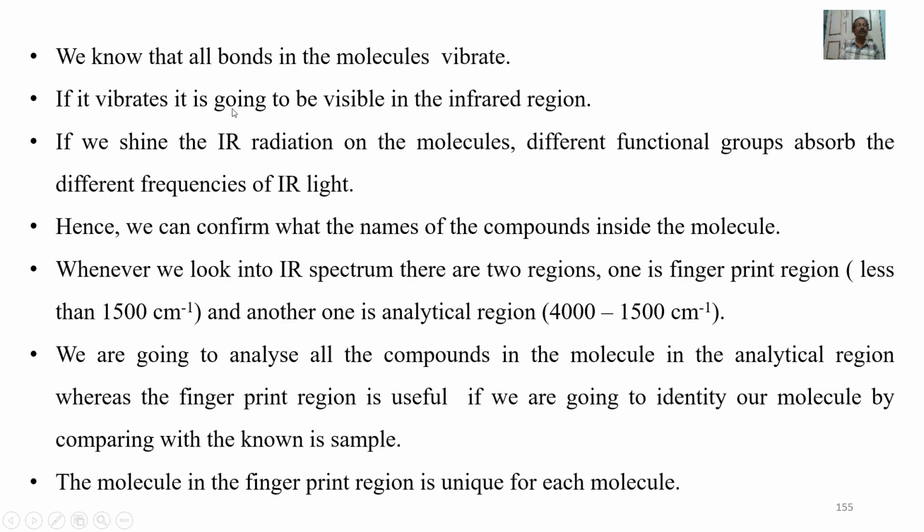We know that all bonds in the molecules vibrate. If it vibrates, it is going to be visible in the infrared region. If we shine IR radiation on the molecules, different functional groups absorb different frequencies of IR light. Hence, one can confirm the functional groups inside the molecule. Whenever we look into an IR spectrum, there are two regions. One is the fingerprint region, which is less than 1500 cm⁻¹, and another one is the analytical region, which lies between 4000 and 1500 cm⁻¹.